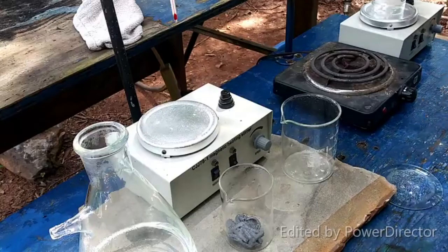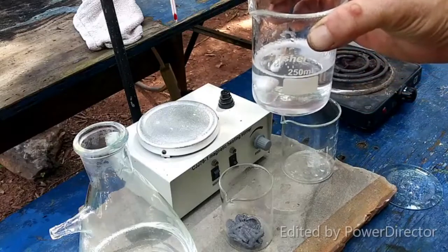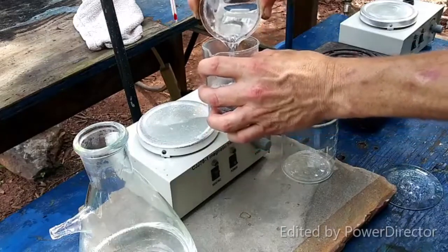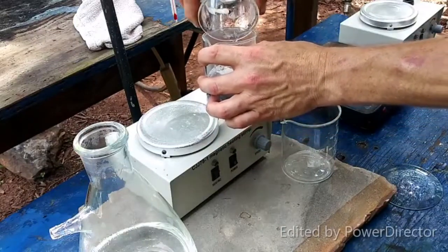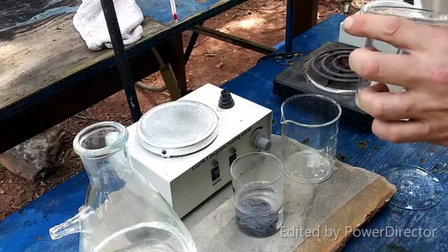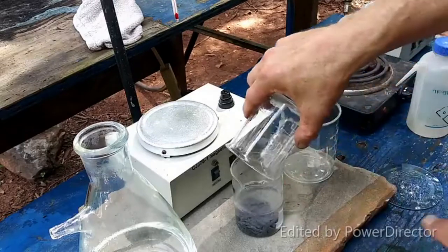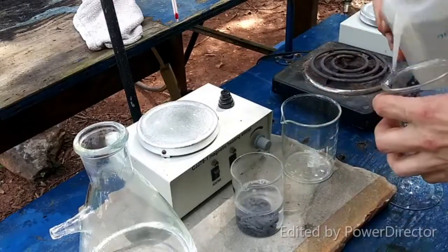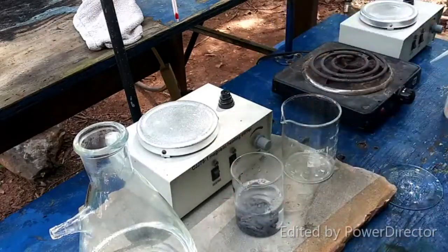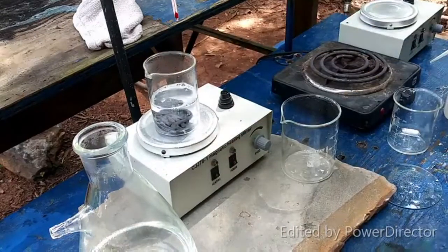For the next step, we are going to take a solution of ten grams of barium nitrate in 100 ml of water and pour that over this lead sponge. We have to boil it for one and a half to two hours.